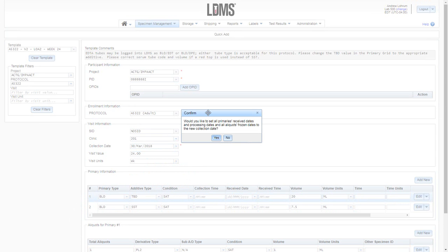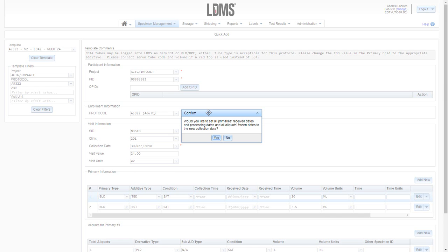Once I choose the date, I see that I am asked to set all of the primaries received dates and processing dates to this collection date. If all of these dates are the same, I can click yes, and they will automatically be set to the date I have selected. If no, I will be required to manually set those dates myself.